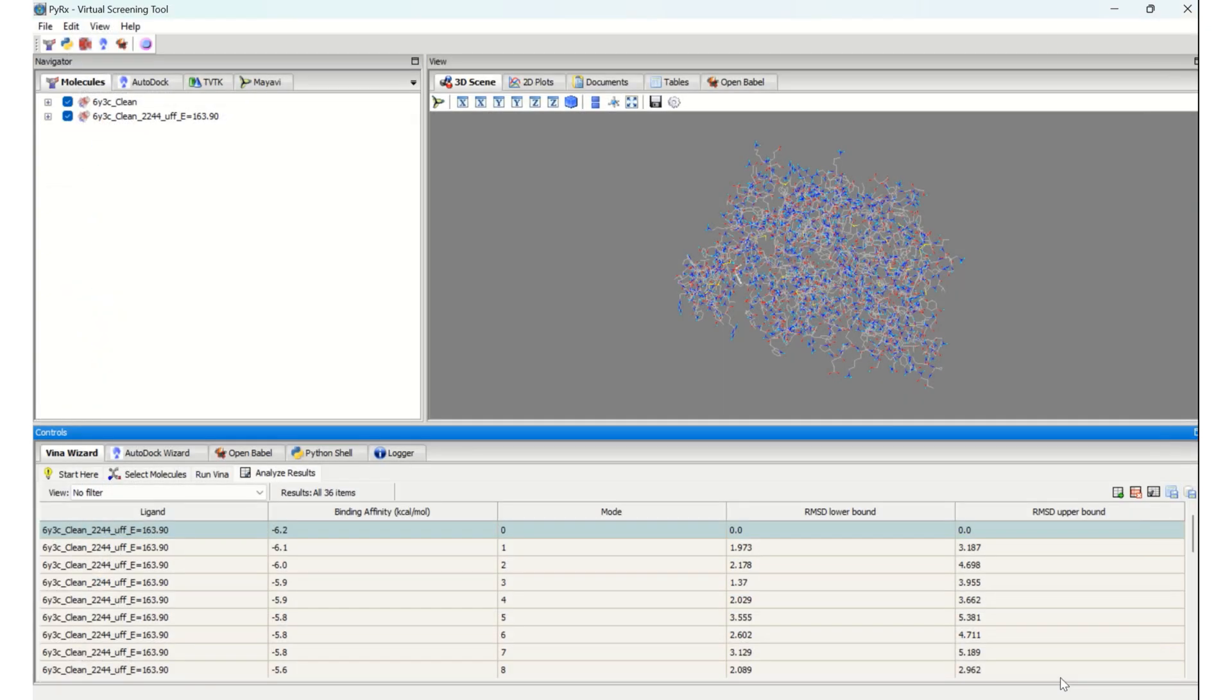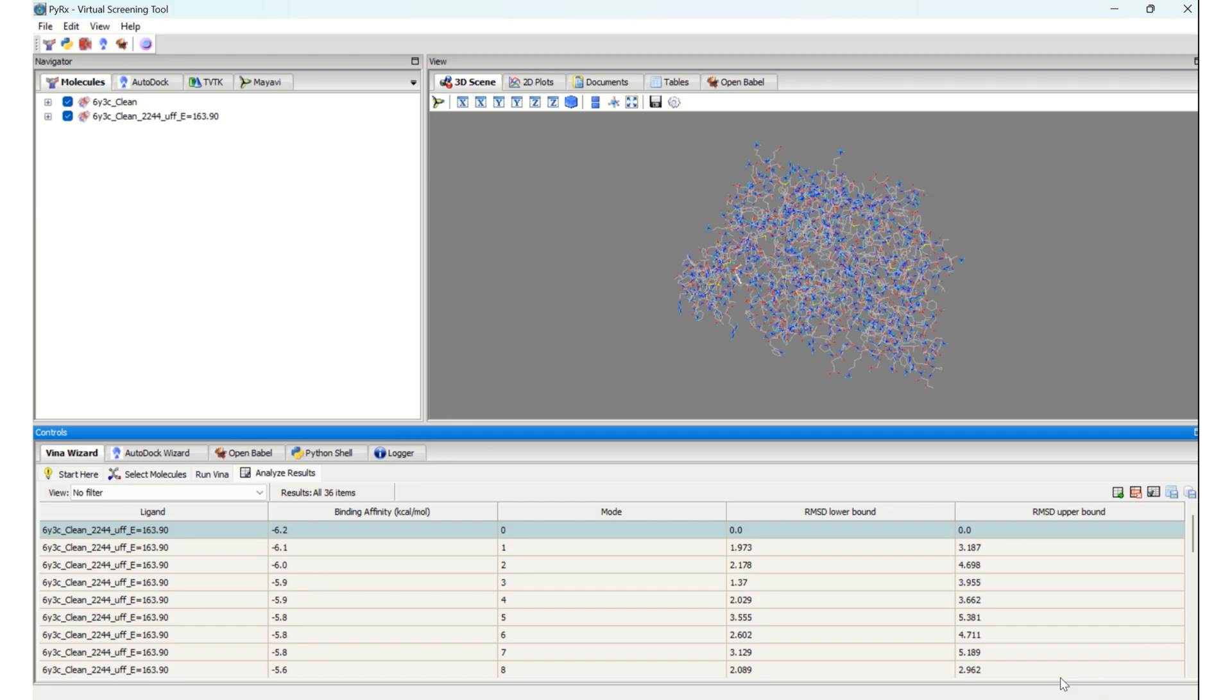This means we have completed running AutoDock Vina simulation for the selected protein and four ligands. The results, that is the docking scores, have been saved into your folder with the name 'results'. So now let us see our folder.